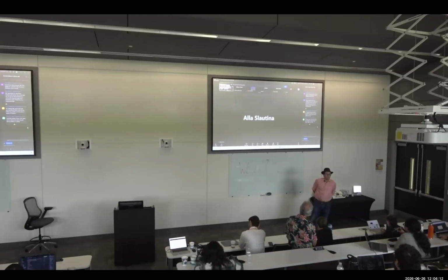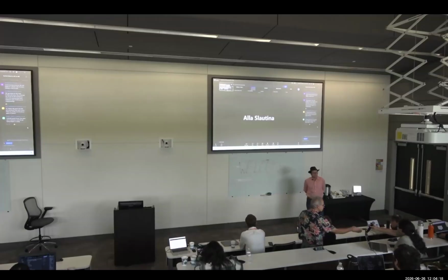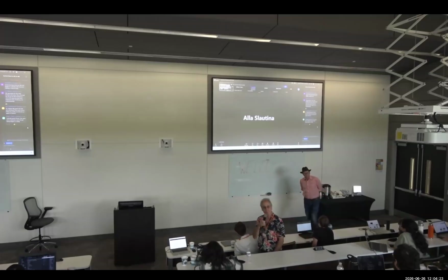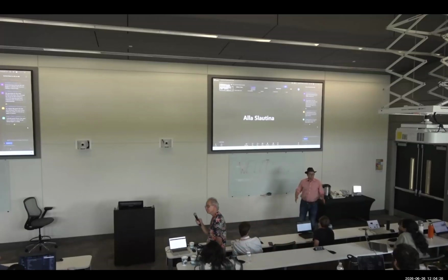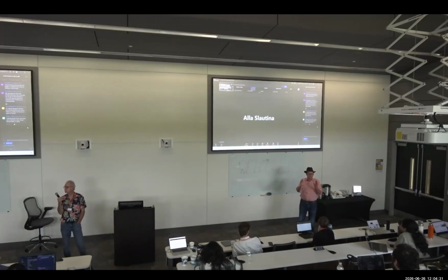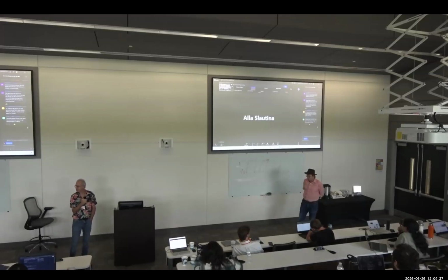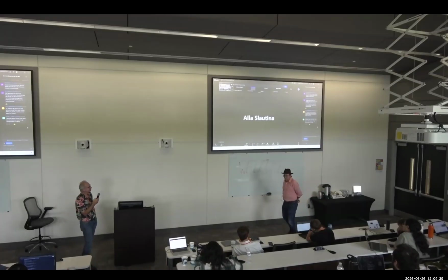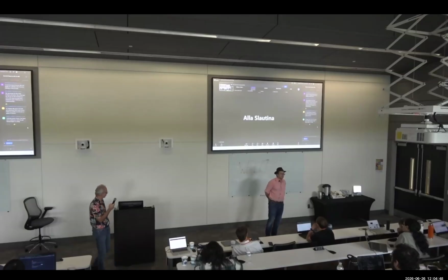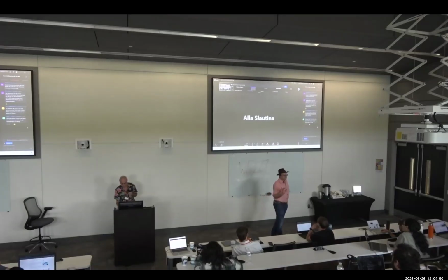So you can run the experiment for several steps, and if you don't like the result, you can say that you want to redefine the reward function this way. You can have a collection of reward functions and choose from it. You can have a reward function with tunable parameters. For example, if your reward function is intensity in some spectral window, you can just change the spectral window. Or you can talk to your favorite LLM and say that you want to create a reward function that does this and this, please write the code that will calculate it, and then you can substitute the reward function.